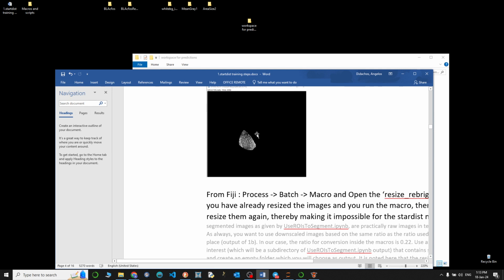The benefit of having a white background is that the mispredictions due to the contours will be at the outer part almost entirely, if not entirely. And then it's very easy to remove them because they have a specific pixel value that we can use as model value. So that's the idea.